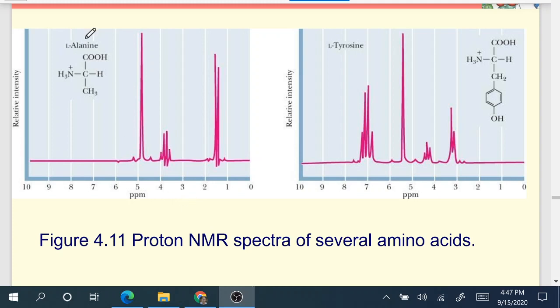For example, here we have L-alanine, and so of course we can't distinguish between D and L amino acids specifically in NMR, but we don't really have to worry about that anyway because they're all L. But anyway, remember your NMR techniques. This is proton NMR, so we're measuring hydrogens, and this hydrogen on the alpha carbon, remember the N+1 rule, has 3 neighbors, so it's going to give 4 peaks, so that's this peak right here, and its integration will be 1, because it'll be representing 1 hydrogen.